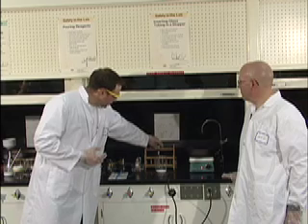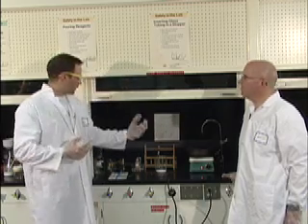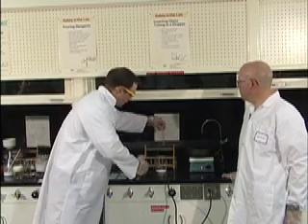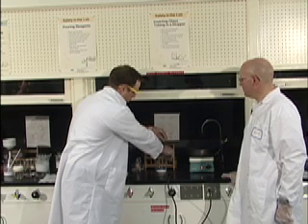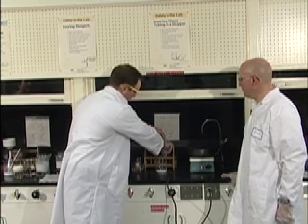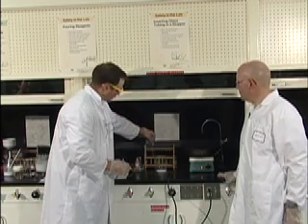It is already going to be pre-measured in a tube for you. And what you're going to do is wait for your instructor to come over. You're going to take it out of the test tube rack, uncork the acetic anhydride, pour it over the salicylic acid, recork it, and then put it back in the test tube rack.